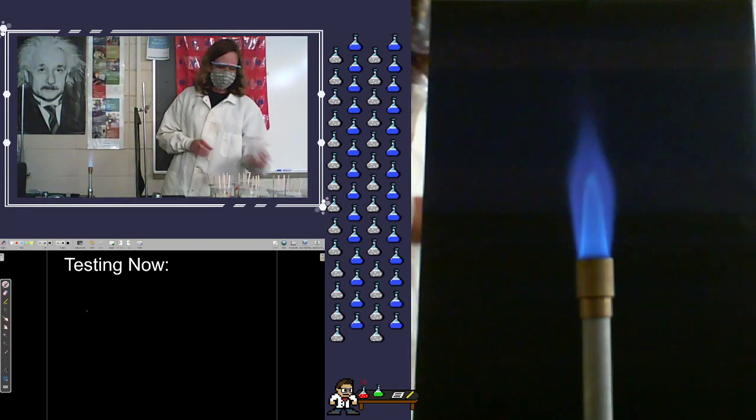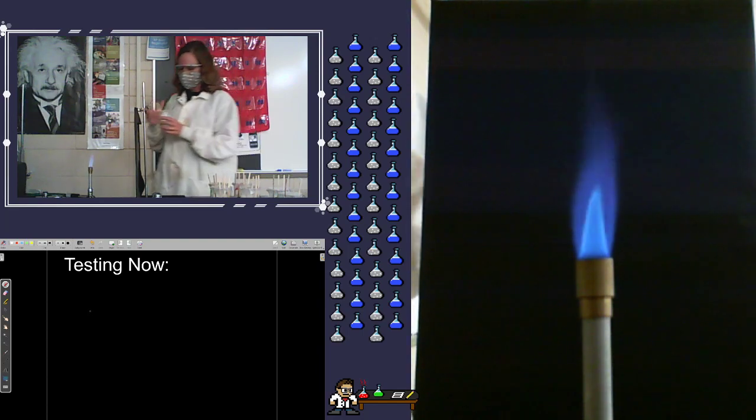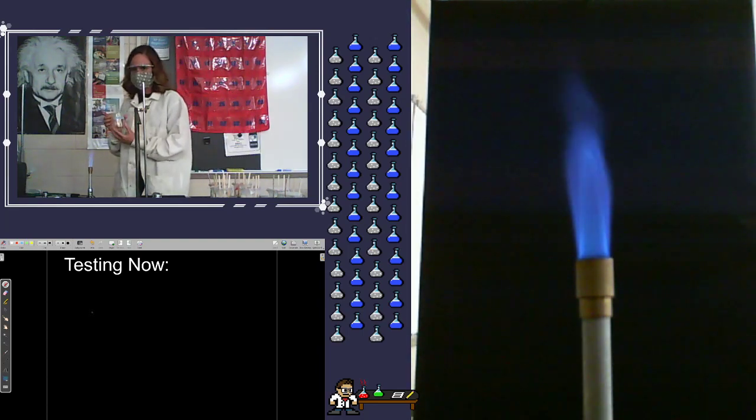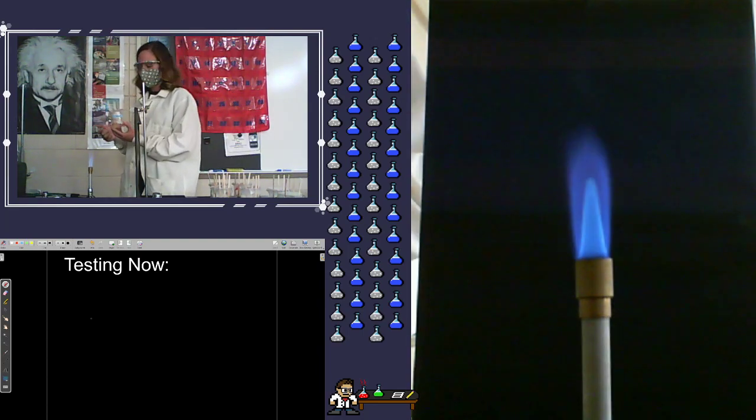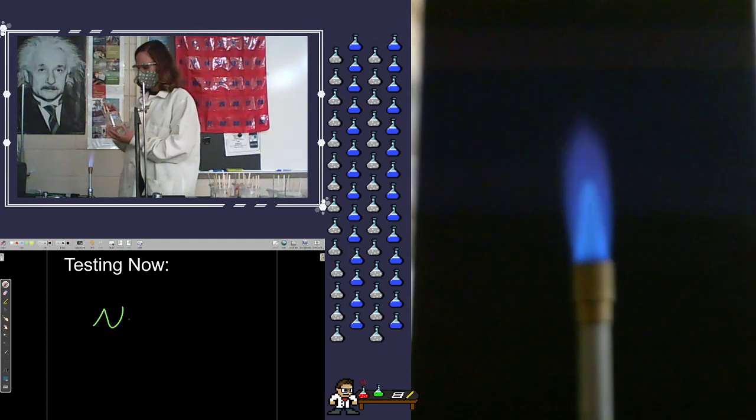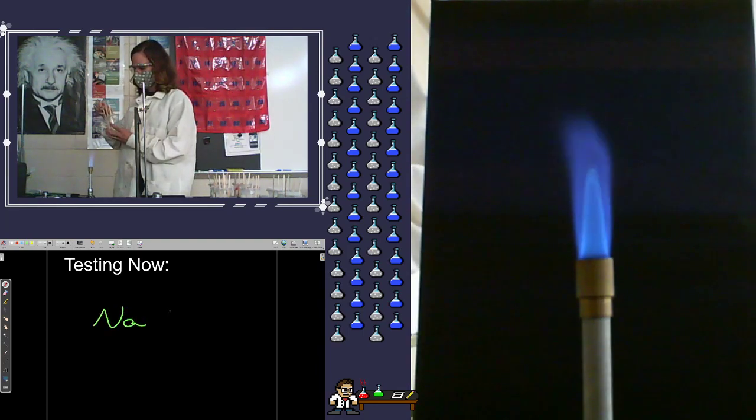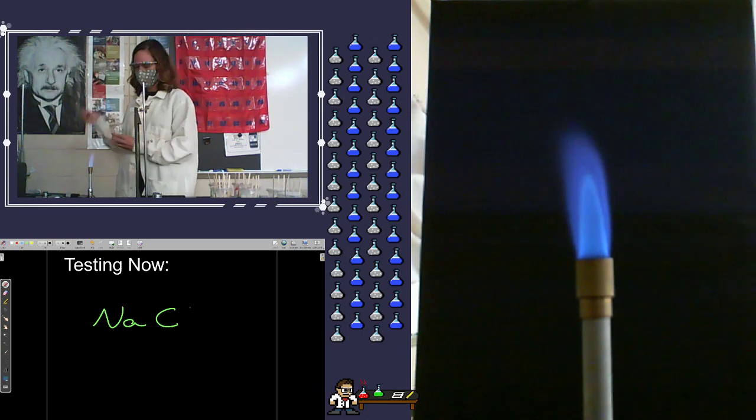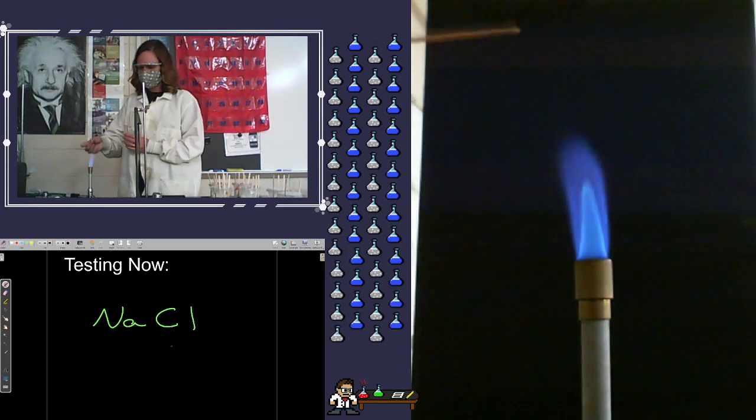Now here is a pretty common one. Here we have sodium chloride or just normal table salt. So we have a salt water solution that we've soaked these splints in.